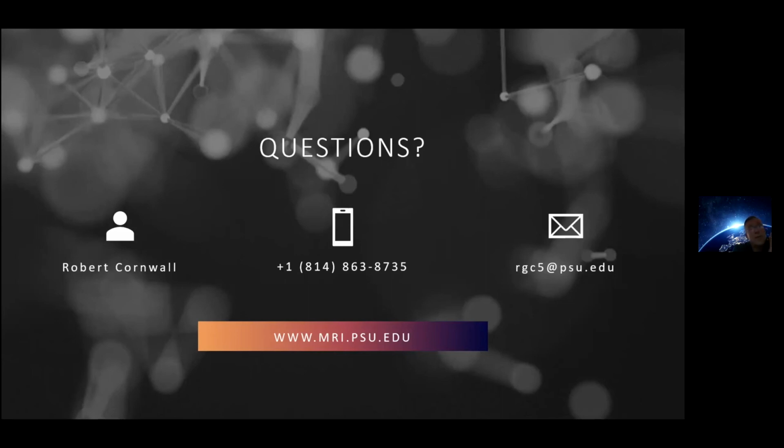We talked to them about the importance of validation, because it's easy to forget to log out and run up 90 hours of something, and then all of a sudden you get a bill for 90 hours when you used it 3, and you're like, what? And the PI is freaking out. It's way easier to recognize those and look at it.